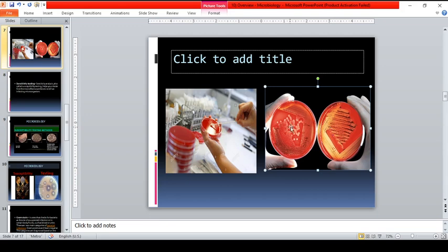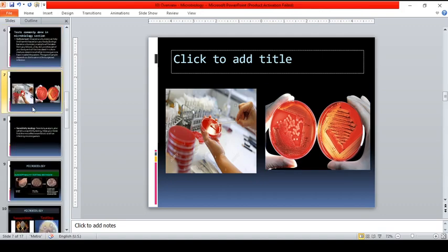Okay? So, through culture media, pwede mo nang makita yung isang colony ng bacteria. Millions of bacteria within just 24 hours. So, without using culture media, matatagalan bago dumami ang bacteria mo. Okay?